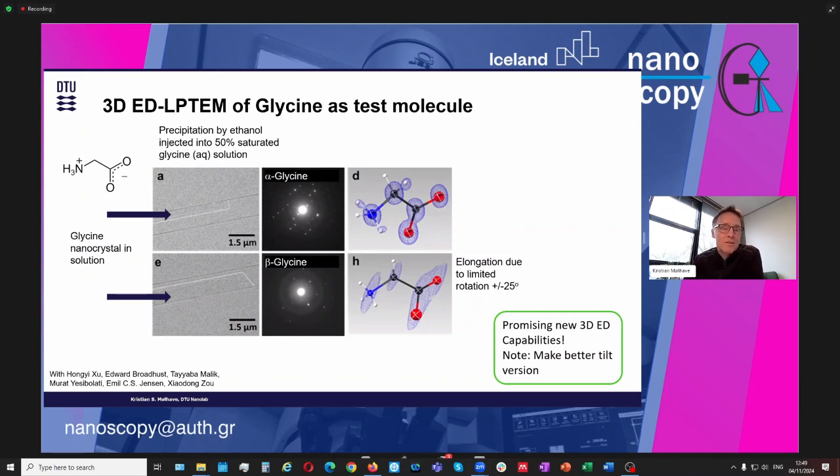And there are several companies now beginning to make electron diffraction systems, and hopefully they'll eventually adopt into using nanochannels as well, to not just look at dry or cryogenic samples, but also to look at samples in liquids. So that's one application you could say that has some maybe bigger relevance out in the real world.